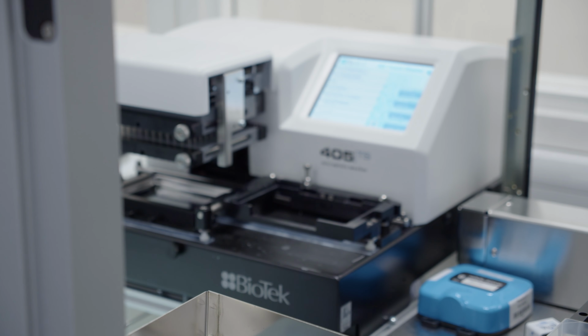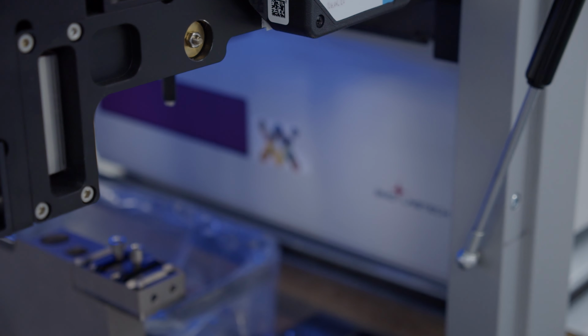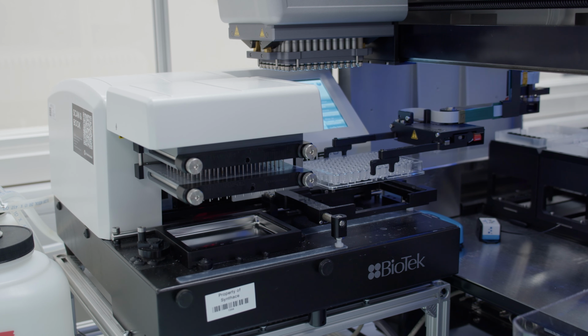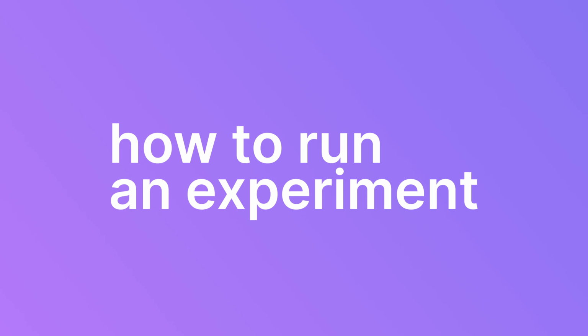We've also set up our Hamilton STAR with a BioTek plate washer and a CLARIOstar plate reader, both of which the Hamilton can move plates to. So here's how you run an experiment on a Hamilton STAR using Synthace.